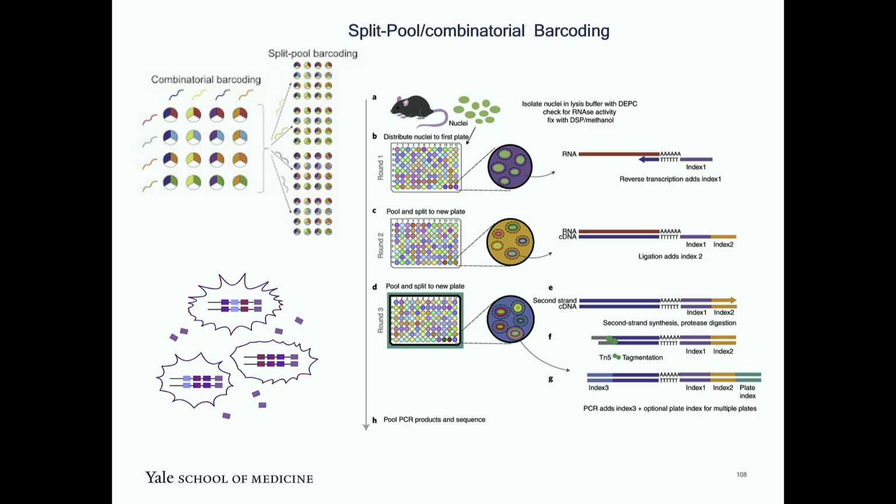Suppose this is a monocyte or this is... That is based on your transcriptome. So it is only the barcoding part I am talking about. So what is this barcoding? Barcoding is actually, you have an RNA, and you are putting a tag in front of that RNA to identify it.